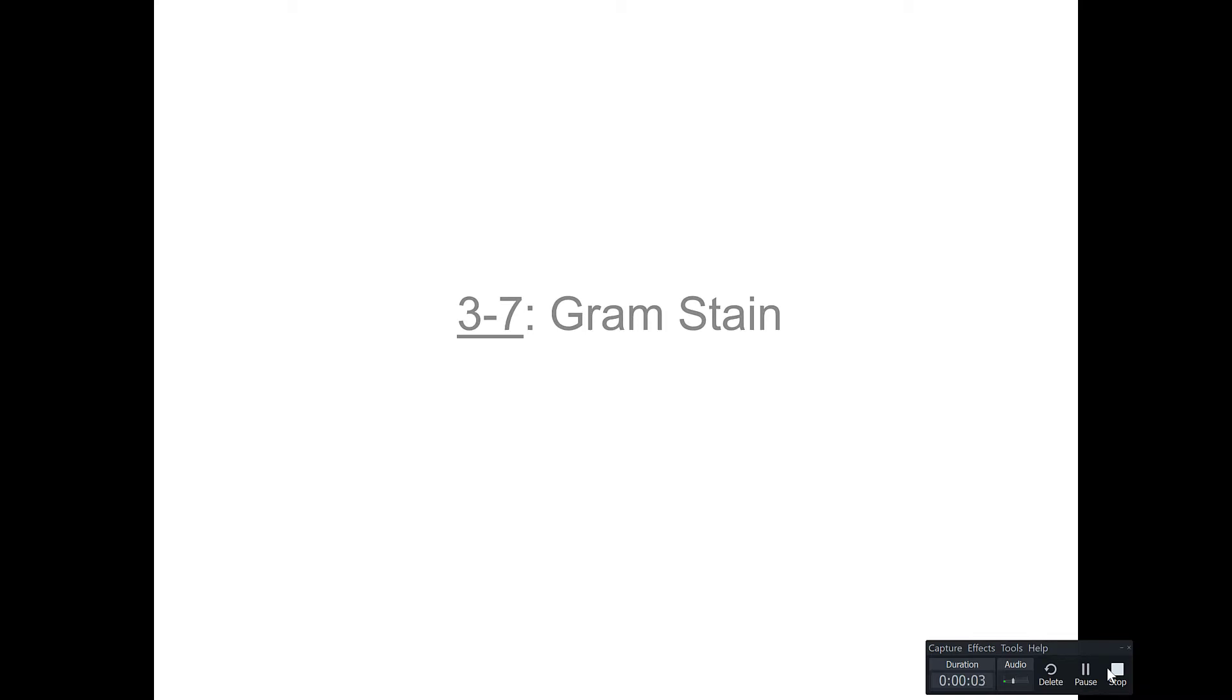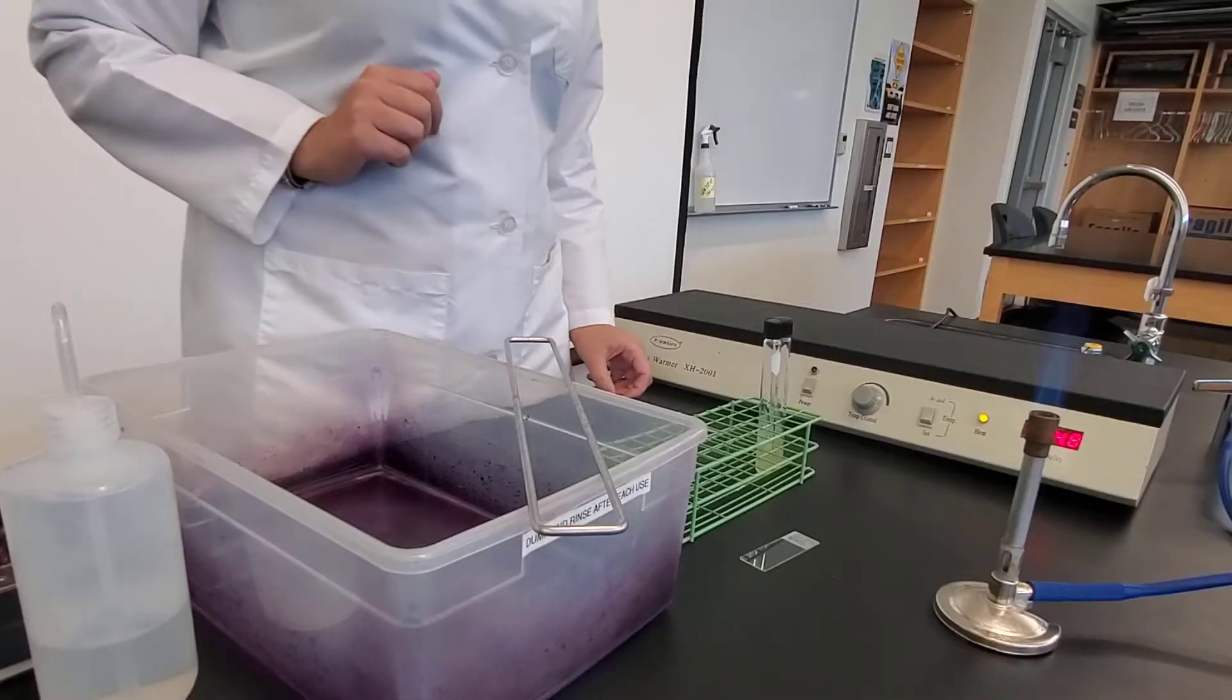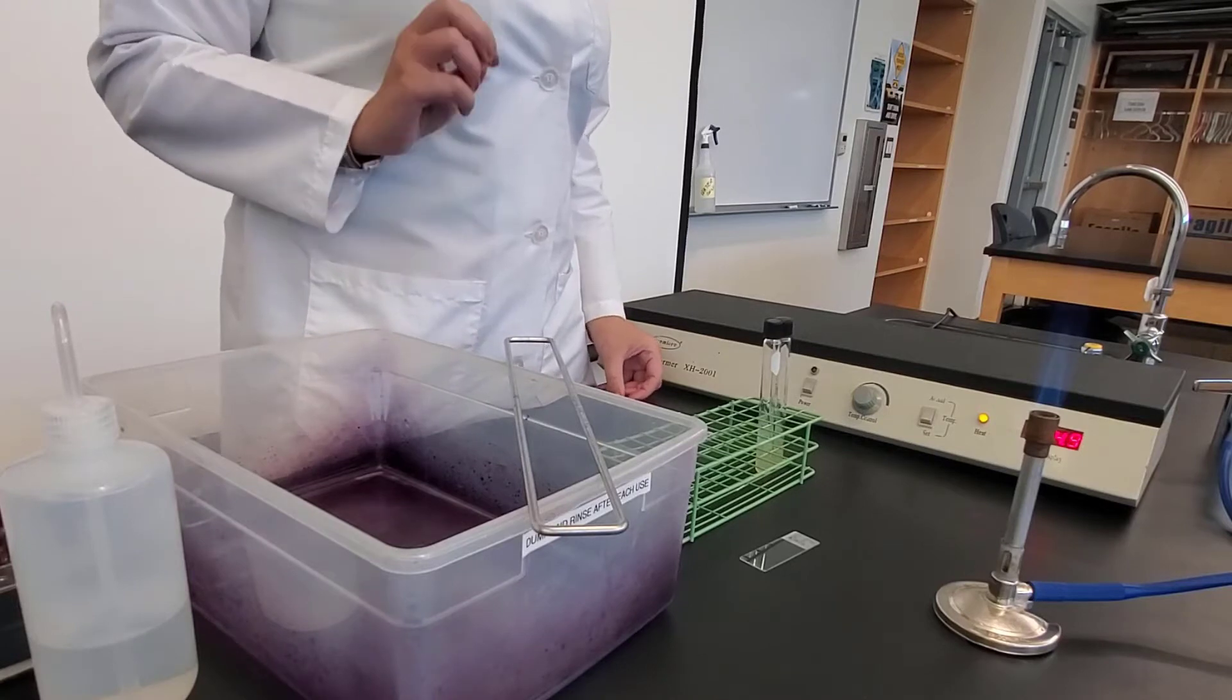In this video, I'm going to show you the technique for a gram stain, and this is activity 3-7. I'm going to walk you through and show you how to make a heat fix smear, and then how to perform a gram stain.